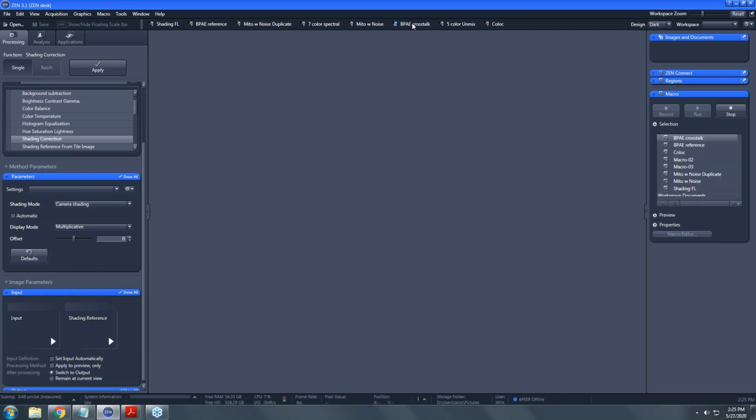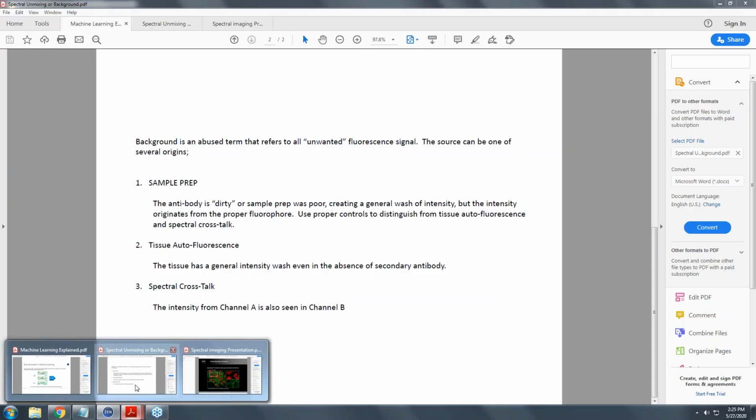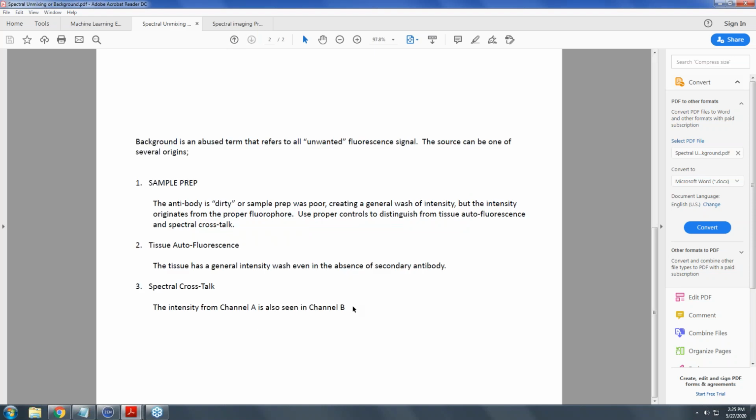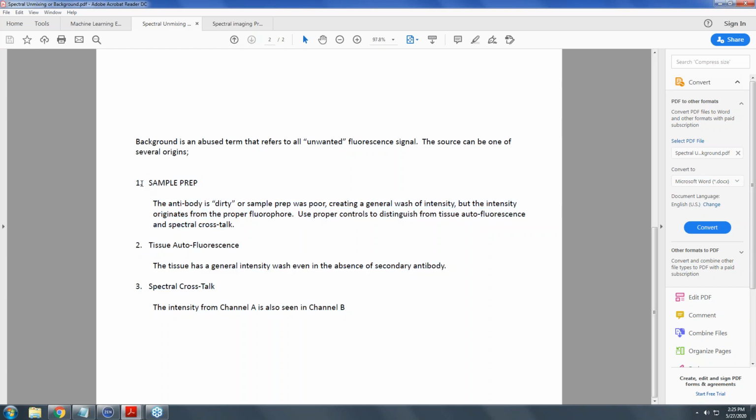Okay. Actually, I'm going to take advantage of that lag, and I'm going to bring up my little discussion point here, if you don't mind, Chantal. So the question that this originated from is, I have background in my image, how do I get rid of it? That's a pretty common question, so I thought this is something we should address. So let's talk about what background is before we go to spectral unmixing, because the two things aren't necessarily the same. There are 3 main places that we can get background from, and they're very different in terms of how we want to deal with them in the microscopy.